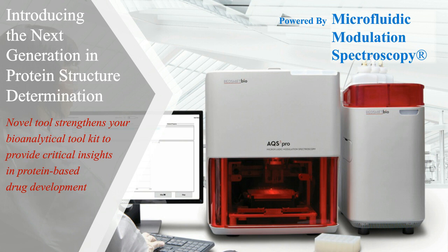And then on the right-hand side, you can see the smaller unit, which contains the inbuilt computer and some other mechanics, such as the pumps. And at the top, shown in red, is the lid to the degasser unit, in which you can prepare your more viscous samples if you require. The whole system, both units together, occupies quite a small footprint within the laboratory, requiring about 1.5 meters in width and less than 1 meter in depth, depending on the configuration.